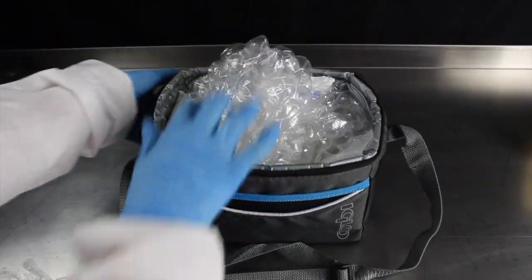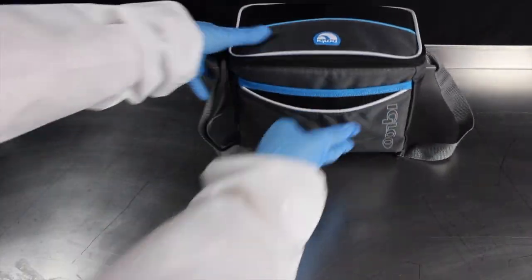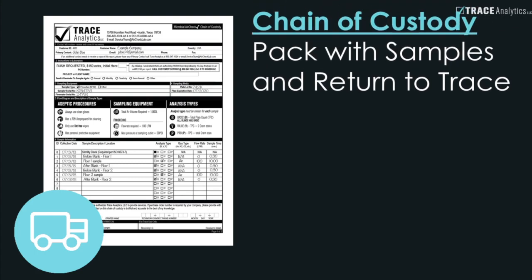Seal the insulated cooler and place it into the small box. Before closing the box, insert your chain of custody into the sleeve.